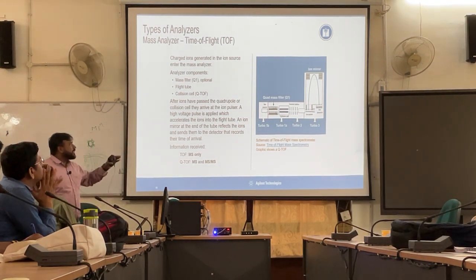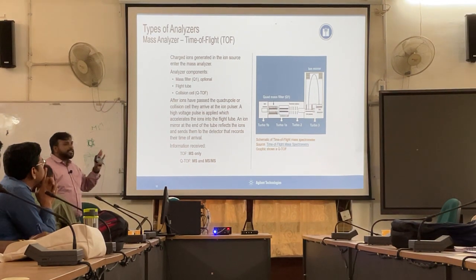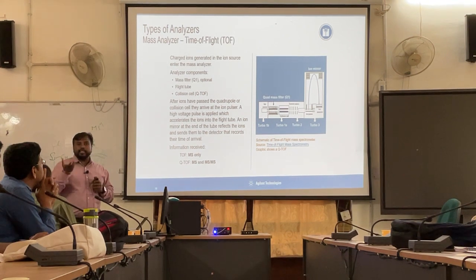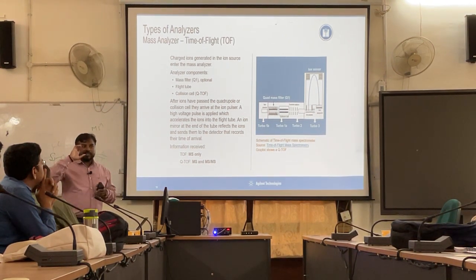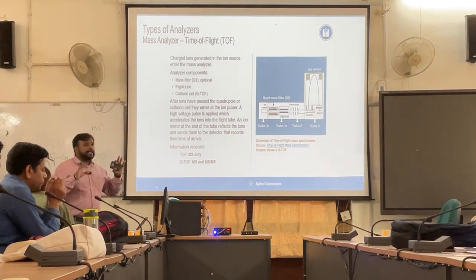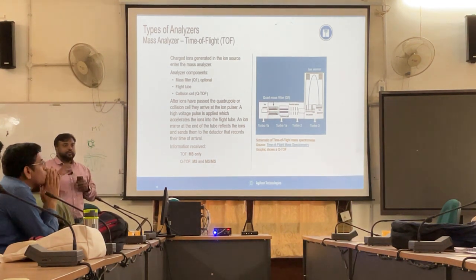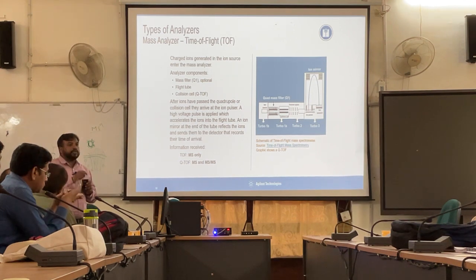The chronology of the ion movement is that desolvation happens in the ion source. The source is nothing but converting the solvent into an aerosol, because we know that the mass spectrometer identifies only ions. So there are two modes with different language understanding. One talks about the liquid phase of chromatography, the other understands ions. LC always works with the liquid phase, while MS understands the language of ions, so we have to convert the liquid into ions.